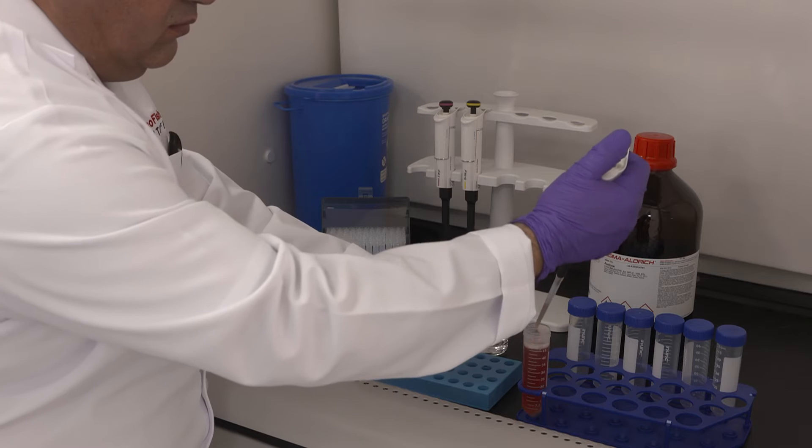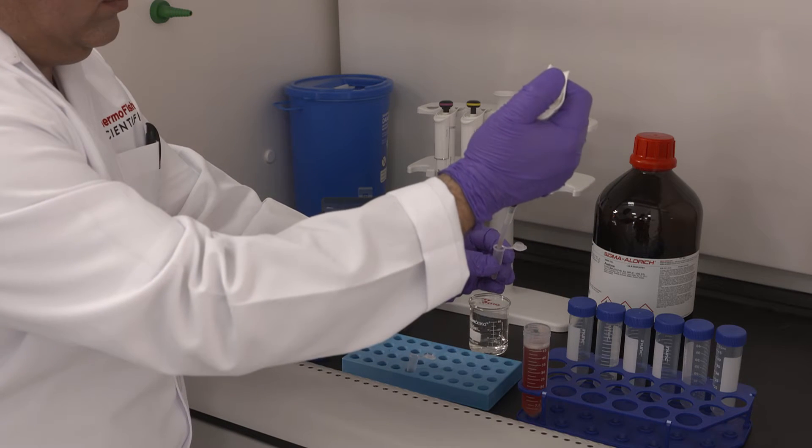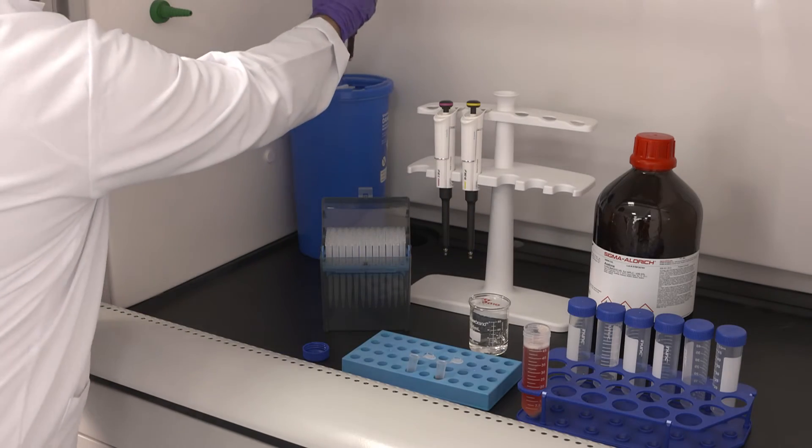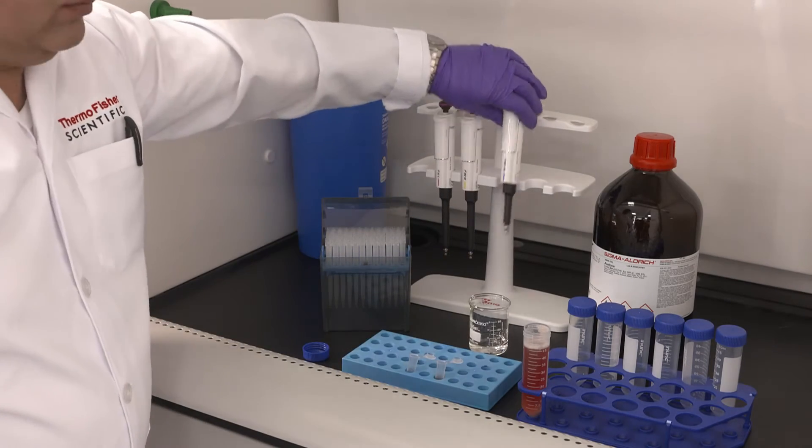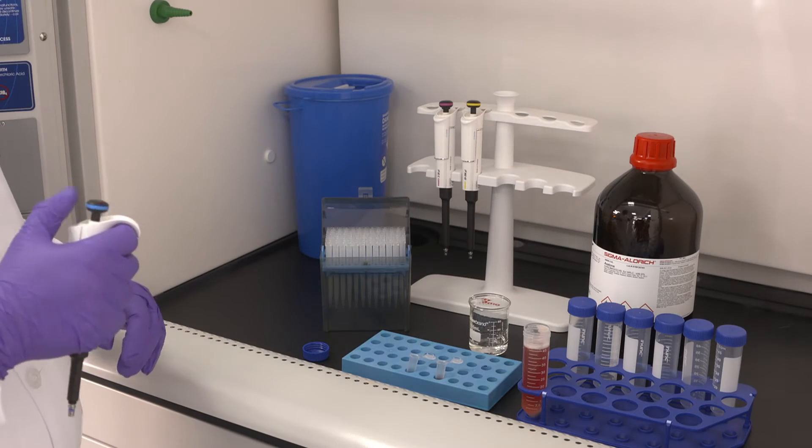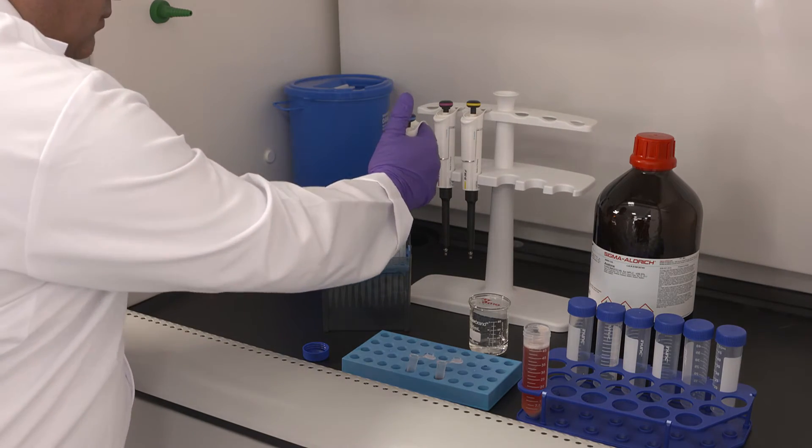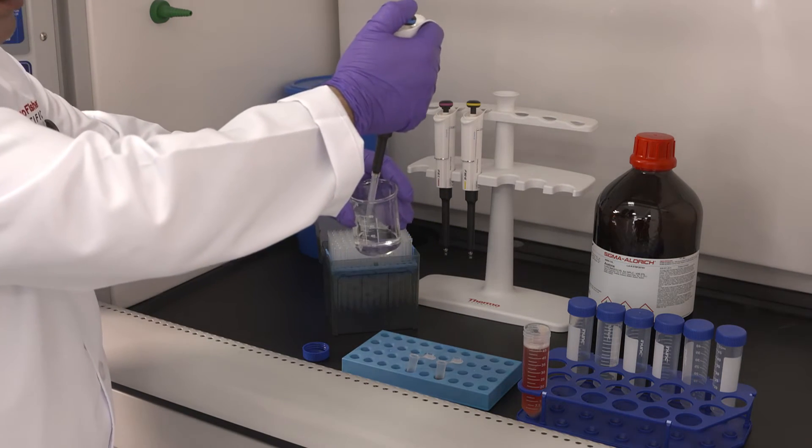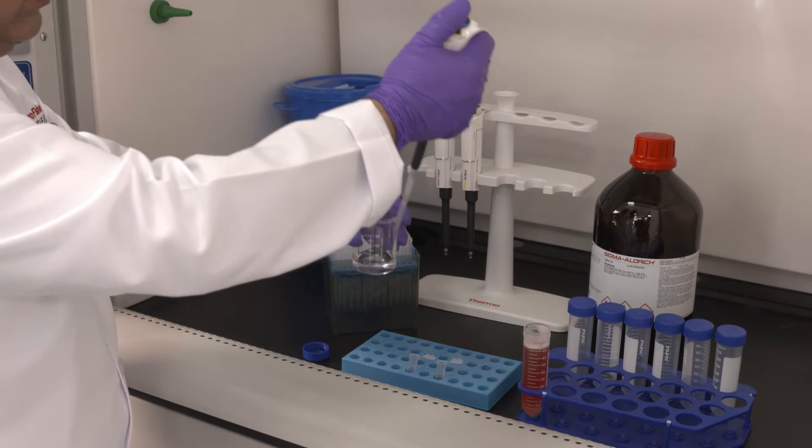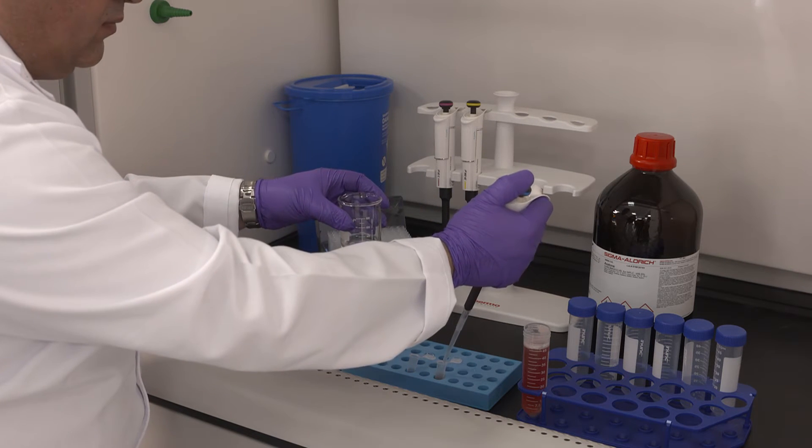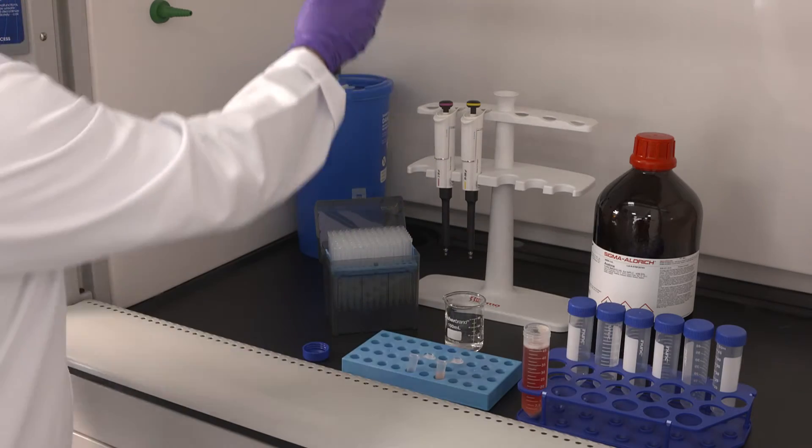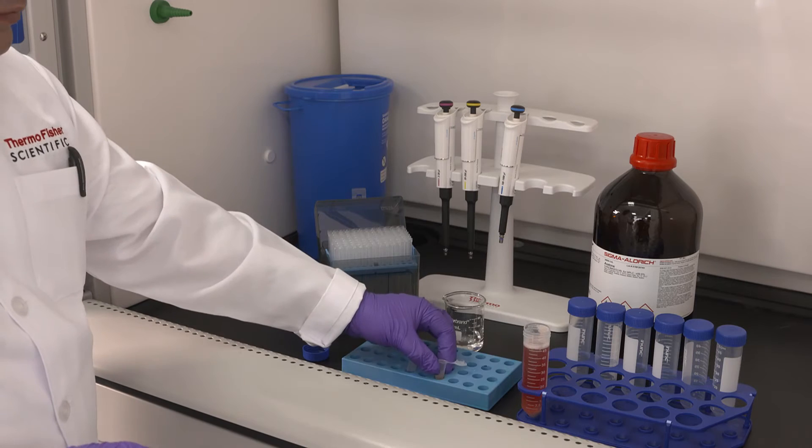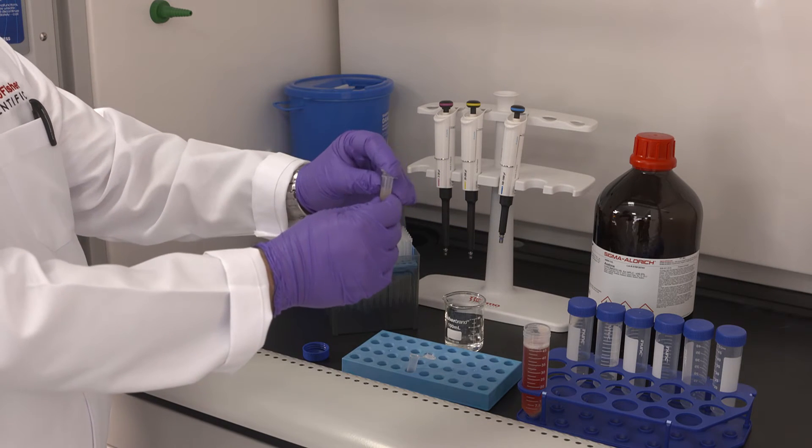The supernatant contains proteins that we will extract using acetone. 500 microliters of the supernatant were taken. Now we will add 500 microliters of acetone so protein will precipitate. Acetone will also extract excessive fat that can be present in the mixture.